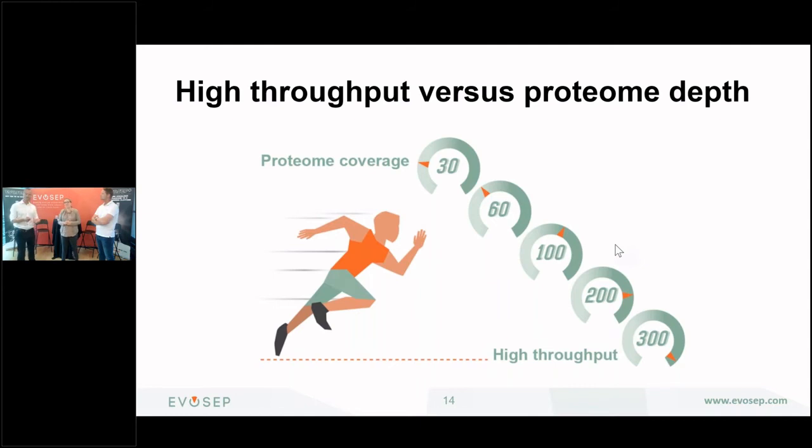Exactly. So at least in our world, that is high throughput. I guess we had targeted analyses in mind when we did it, because 3 minutes is a lot of time for target analysis. We just want to have a few peaks, and for that it'll be super good. It wasn't necessarily thought of as proteomics broad coverage at the time, but now mass specs have picked up speed, and you actually do get very nice depth. With the latest numbers from Bruker and DIA-NN, the depth they get with the 300 samples per day is quite amazing.